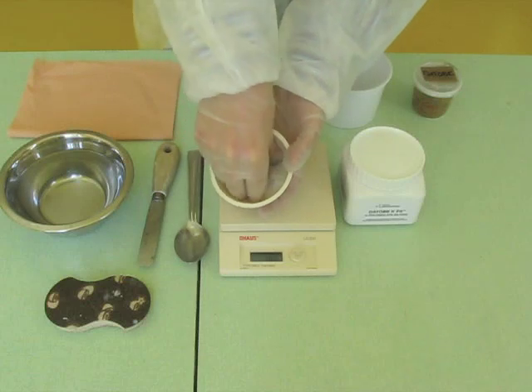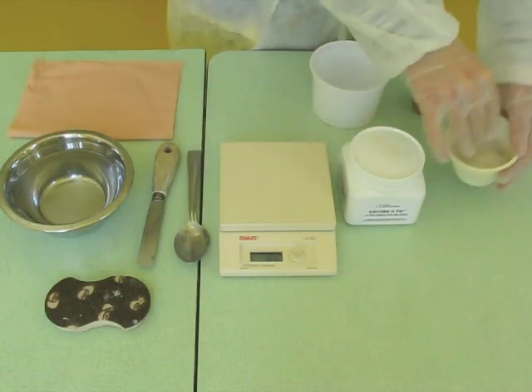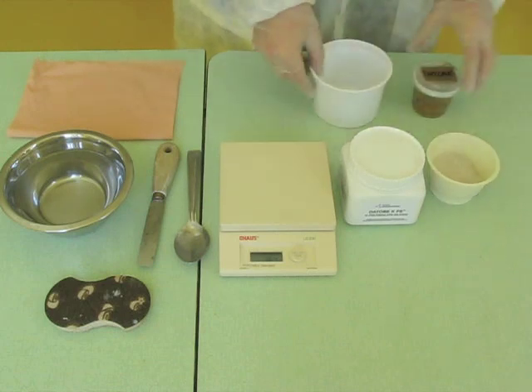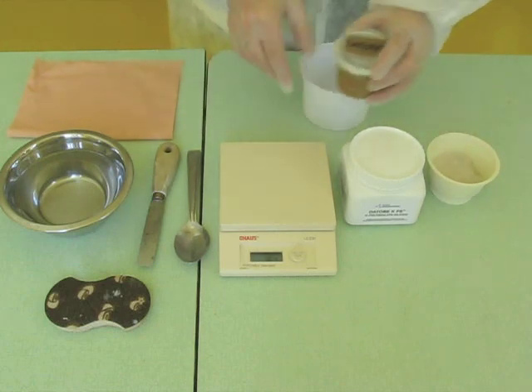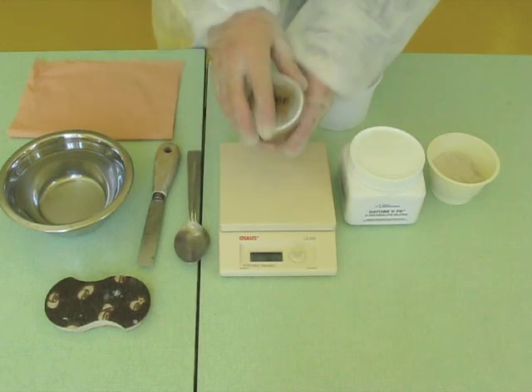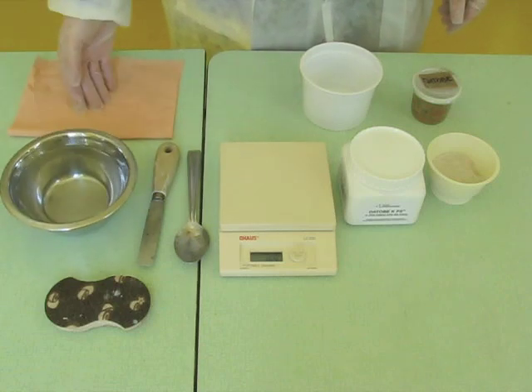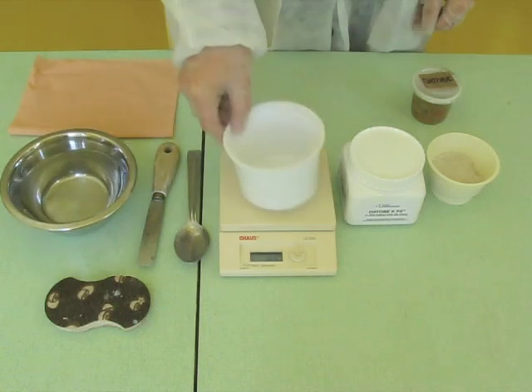It is obvious that the use of laboratory equipment makes the operation easier. The lab technician should use an overall and gloves and respect the safety and security rules that apply to his laboratory. He may be assisted by a second technician in charge of cleaning the tools immediately in water before the hardening of the binder.